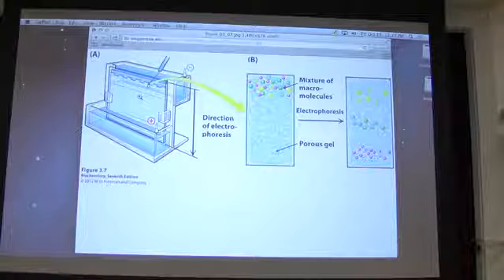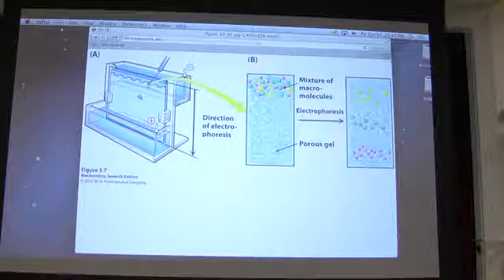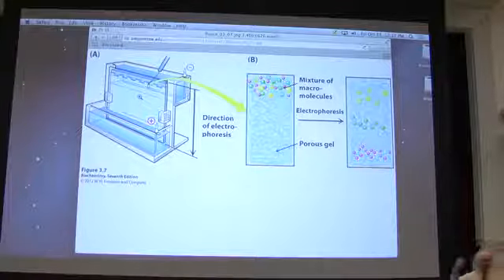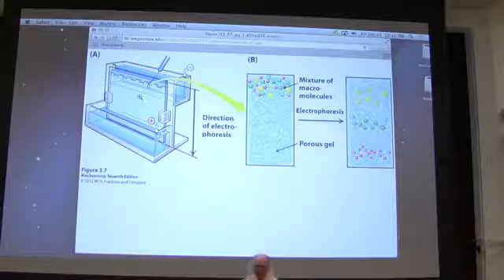Okay? Since the size is proportional to the number of negative charges, and the force is acting on those negative charges, the force divided by the size of the molecule is the same, whether it's a large molecule or a small molecule. So if the force is all the same, what's the basis of separation? This becomes the easy part. If the forces are all the same, the thing that moves the molecules is how fast they can travel through those pores.